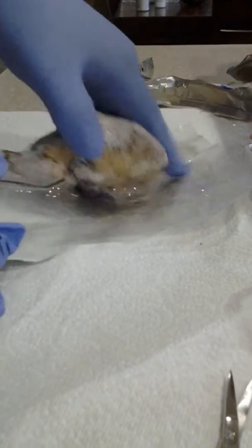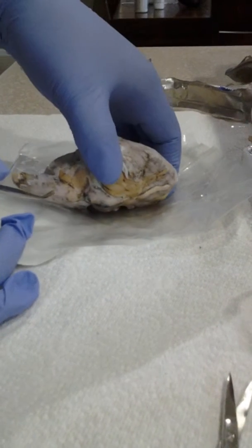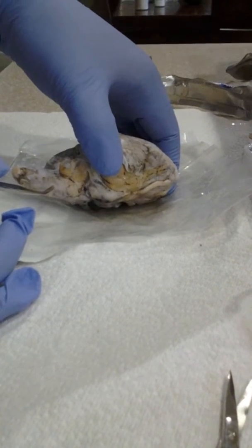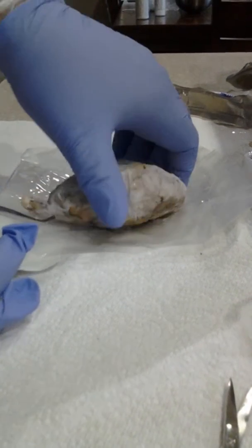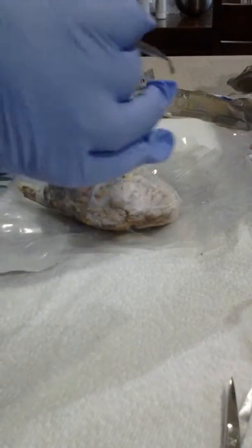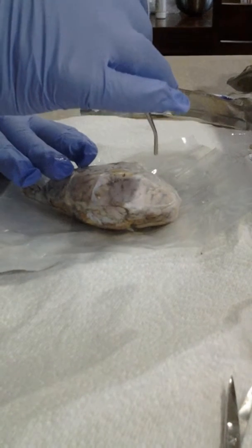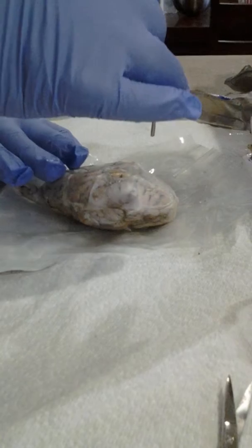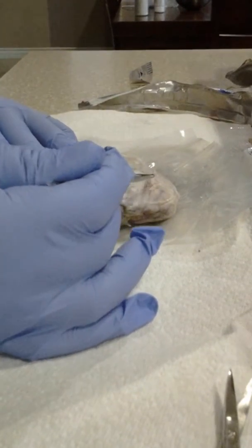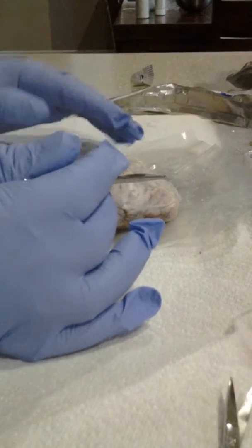The brainstem down under here is for breathing, blood pressure, heartbeat, swallowing, alertness and sleepiness, body temperature, and digestion. The frontal lobe is for movement, thinking initiation, reasoning, judgment, behavior, emotions, memory, and speaking. The parietal lobe is for knowing right from left, sensation, reading, understanding spatial relationships.